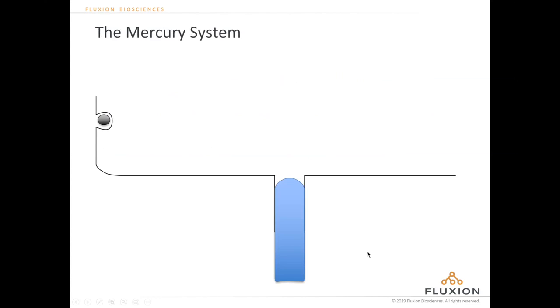Okay. Now this cartoon explains a bit about the mercury fluidic control system. Because everything is actually happening inside of the plate, the flow and everything, the compounds actually reach all the way to the main channel. When the main channel is flowing, the pressure is exerted on the compound, and the compound will go backwards, and the diffusion layer will appear between the main channel and the compound.